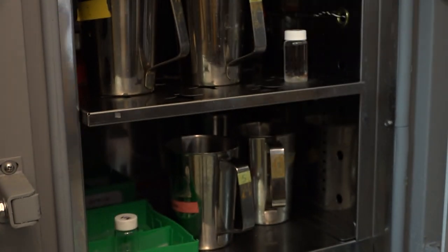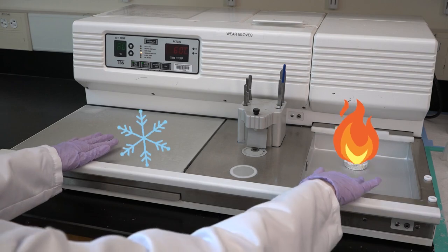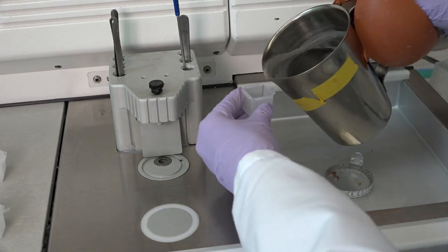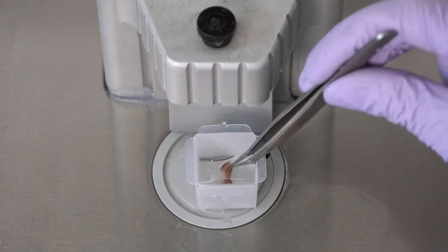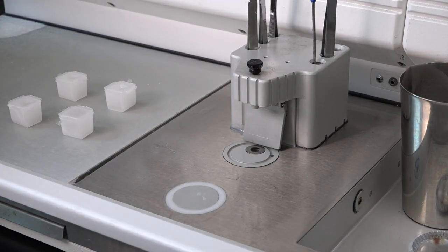Embedding involves putting each of these buds in its own wax cube. To do this, I'm using an embedding machine, which is really just a fancy cold plate and a hot plate. Here are the buds in a tray on the hot plate. I'm going to pour more hot wax in a cube mold, use forceps to place a bud at the bottom of the mold and make sure the bud is laying nice and flat. And then transfer the whole thing to the cold plate so it can solidify.